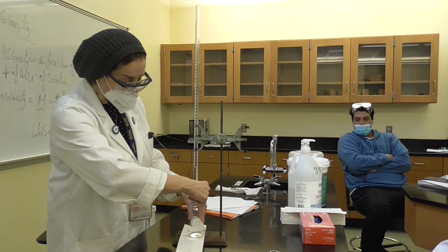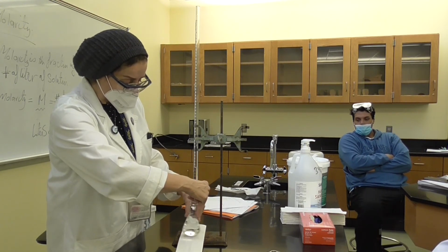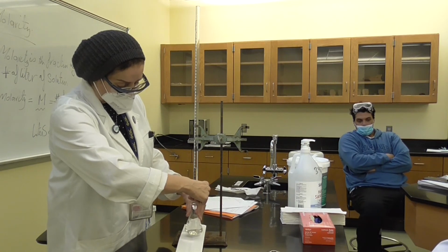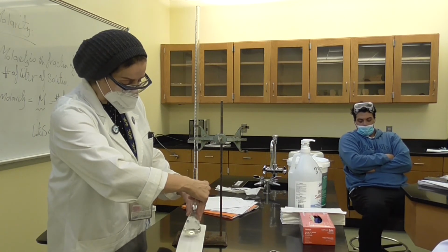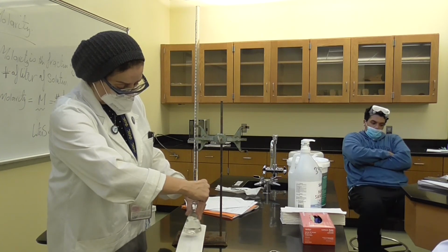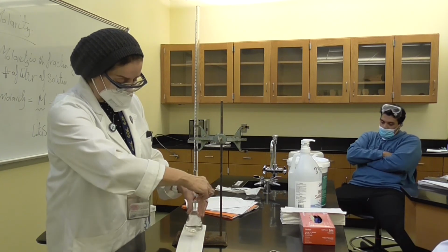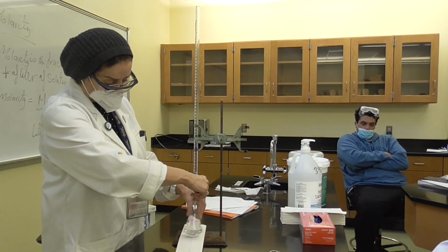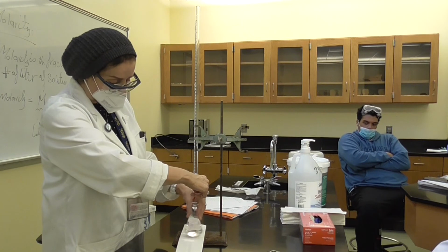It is probably going to take the whole burette of sodium hydroxide, so it's about 50 or 49, something like this. So this is how it is. This is the technique of the titration.